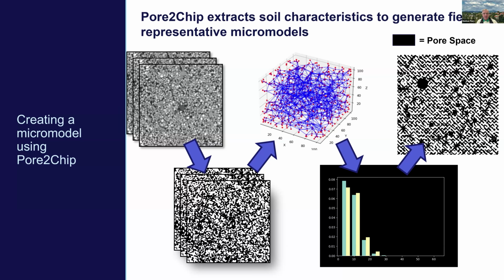So if I just look at those images, they are very different, and you would expect very different flow through those two media. And that's probably not unrealistic because you are mapping a 3D to a 2D image, right? So that's very cool. I wonder why you don't include tortuosity in your targets as well.